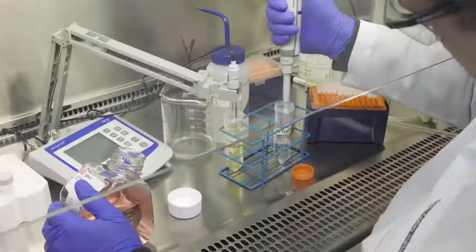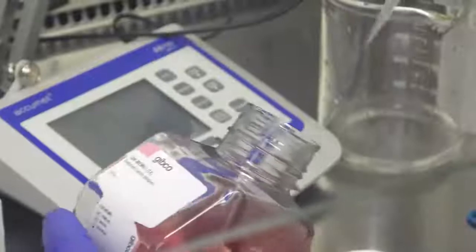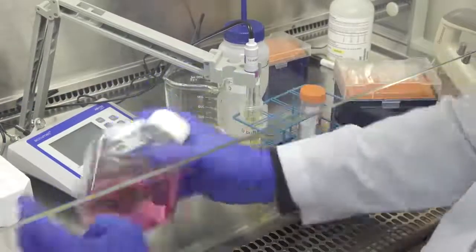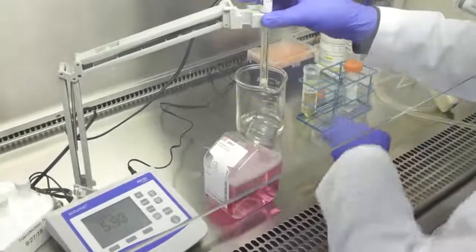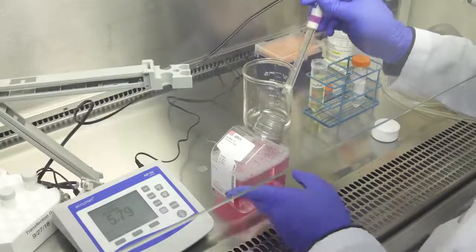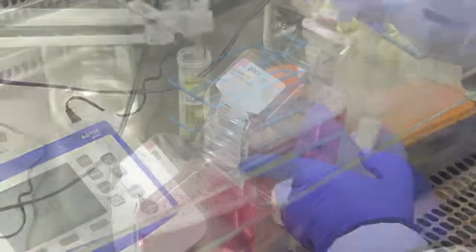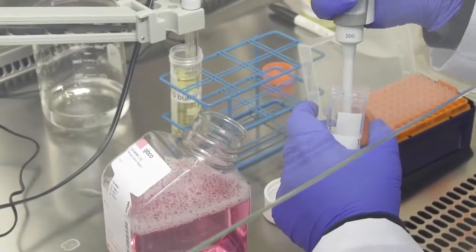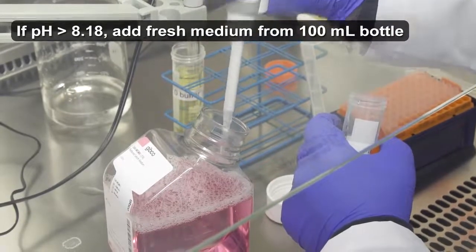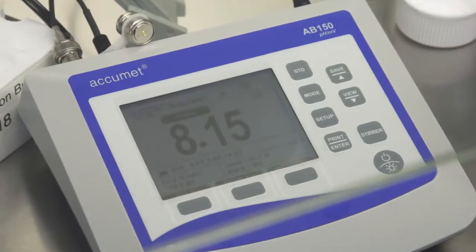To adjust the pH, add 3 to 4 milliliters of 1 molar sodium hydroxide into the 500 milliliter bottle. Close the bottle and mix well. After waiting for 5 minutes, open the bottle and insert the pH meter's electrode into the buffer. Wait until the reading on the pH meter stabilizes. Continue adding small volumes of 1 molar sodium hydroxide until the pH reaches 8.15 to 8.17, making sure to calibrate the pH meter several times during the process.